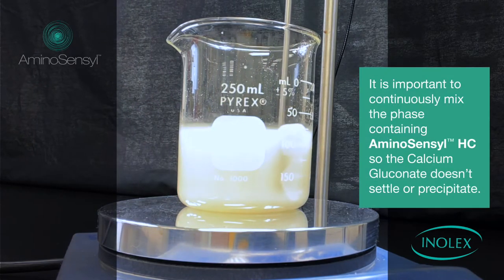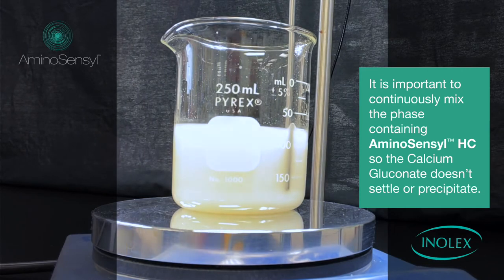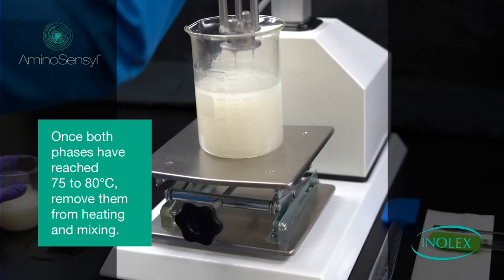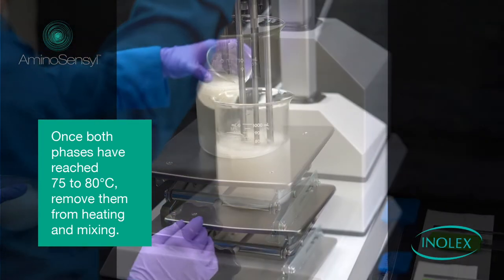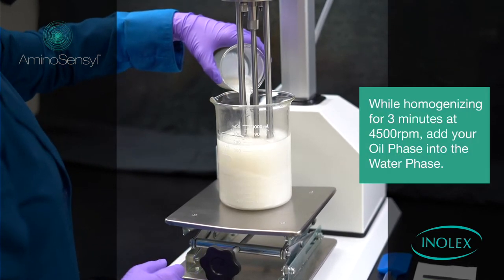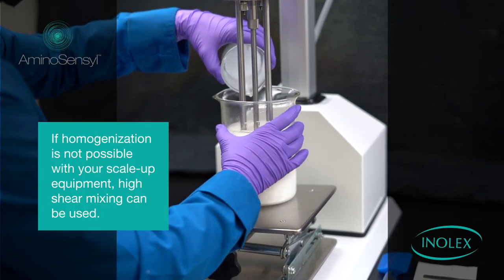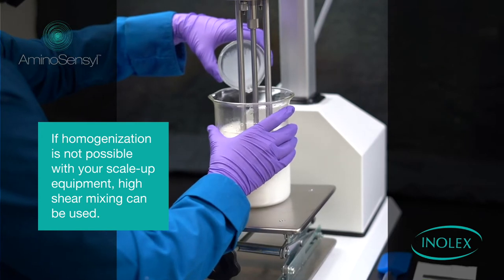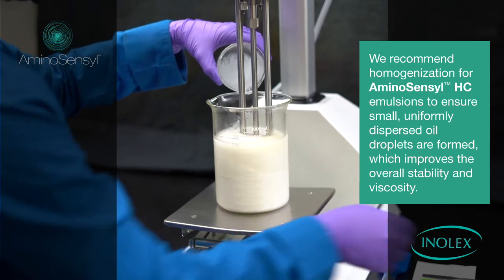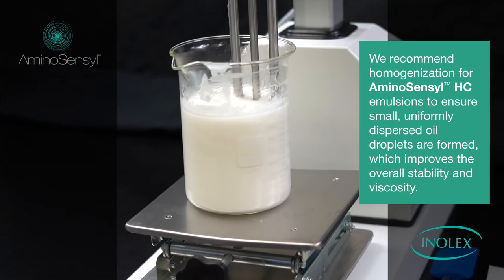It is important to continuously mix the phase containing Aminosensyl HC so the calcium gluconate does not settle or precipitate. Once both phases have reached 75 to 80 degrees C, remove them from heating and mixing. While homogenizing for 3 minutes at 4,500 rpm, add your oil phase into the water phase. If homogenization is not possible with your scale-up equipment, high shear mixing can be used. We recommend homogenization for Aminosensyl HC emulsions to form small, uniformly dispersed oil droplets, which improve the overall stability and viscosity.